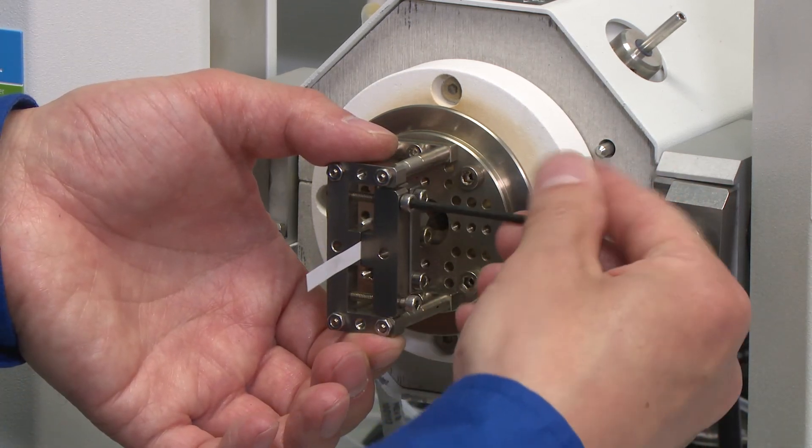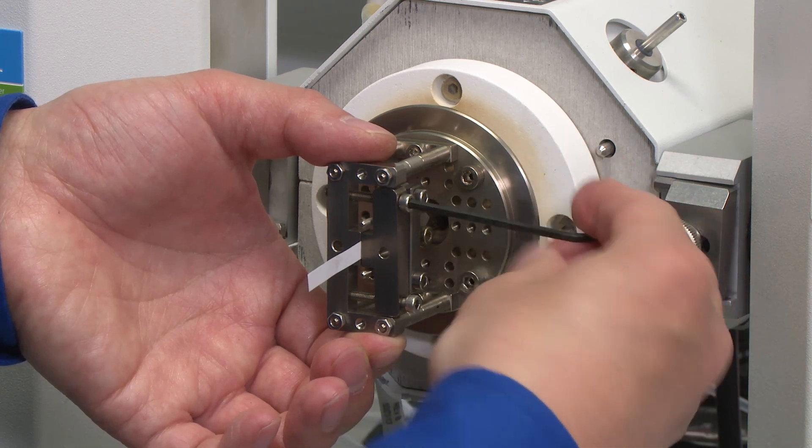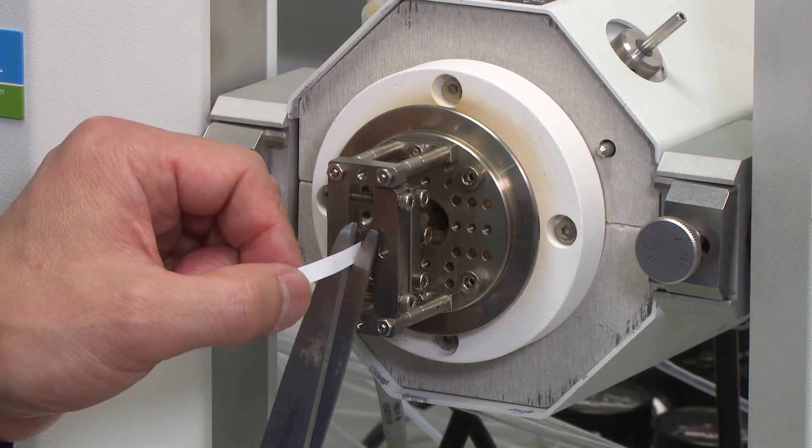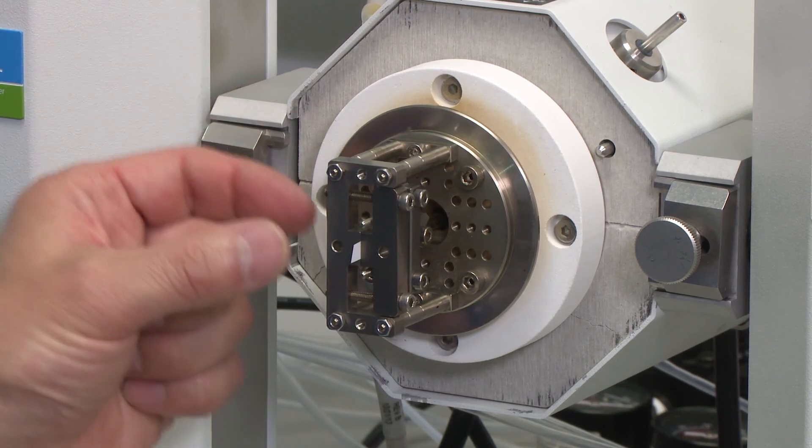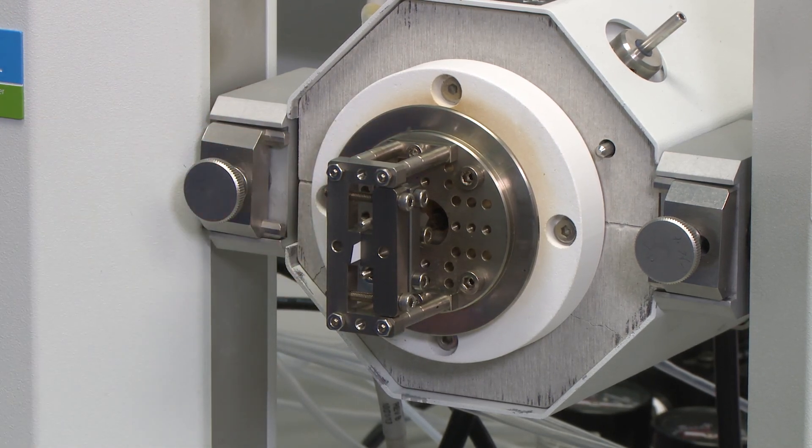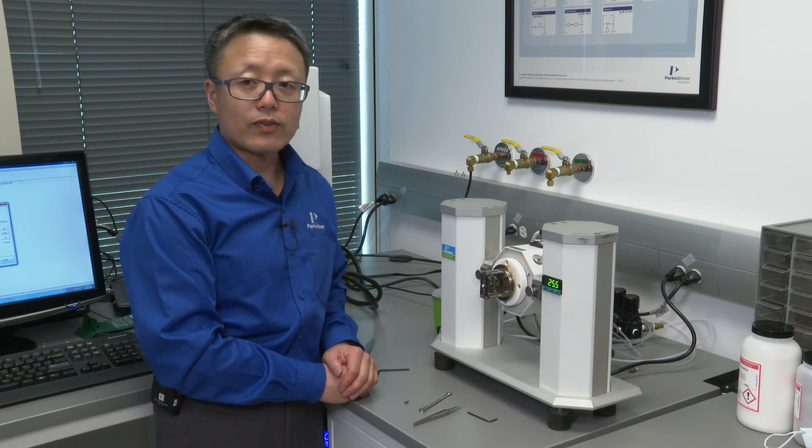Now we can tighten the outer clamp and cut the sample to remove the excessive part, and use a caliper to measure the sample length and enter that into the software.